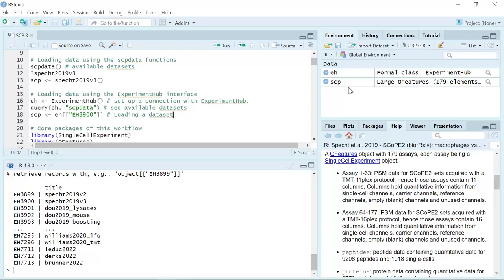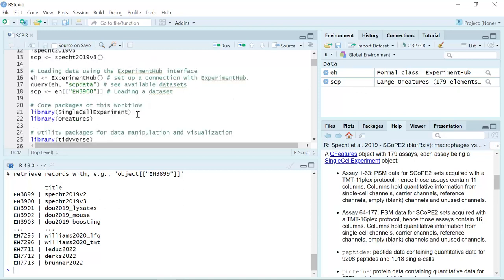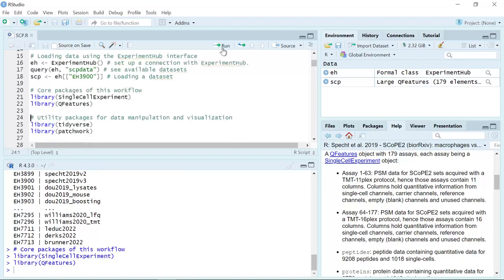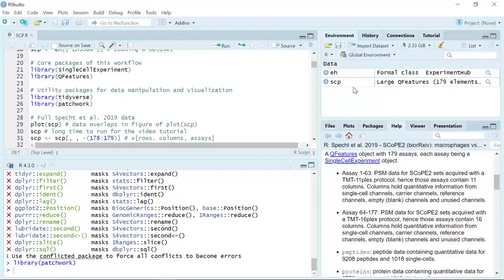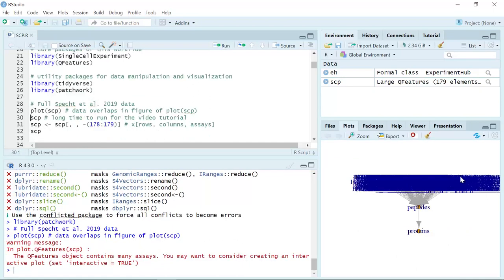To analyze the single-cell proteomics data, we also need to load the package for the single-cell experiment, QFeatures, and also tidyverse and patchwork to manipulate and visualize the data set. We loaded the full data set already, so first let's have a look at it. We can use the plotSCP function to see each single-cell experiment inside the SCP data set. Let's run the plotSCP function — you can see we generate a plot. Let's zoom in.